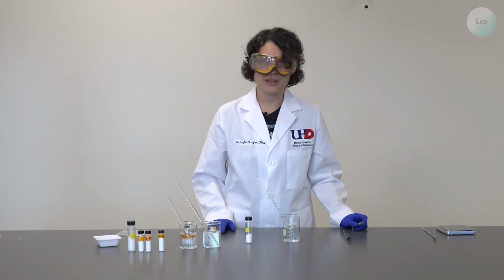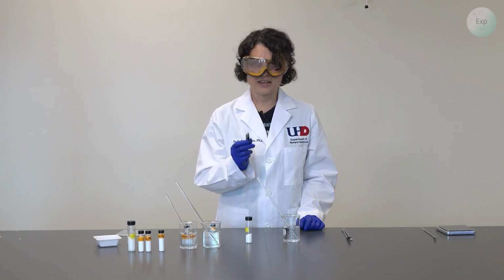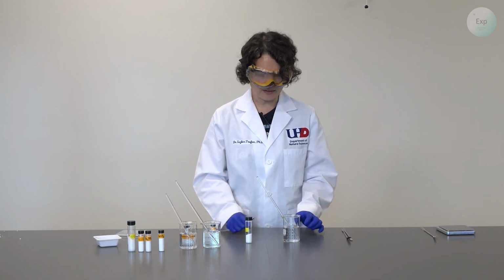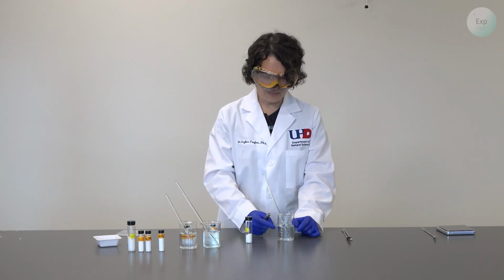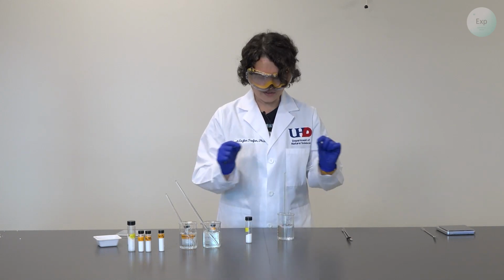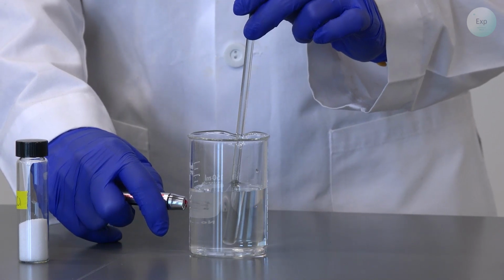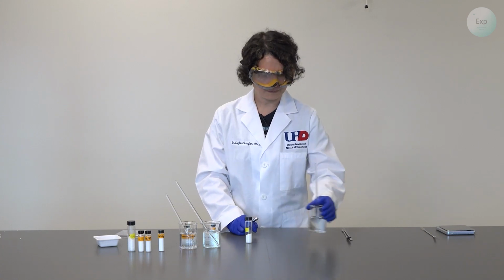Another way we can determine whether we do have a solution or not is to take a laser pointer, and this is through the testing using the Tyndall effect. If we have a homogeneous mixture, the Tyndall effect will not be observed. So when I pass a laser pointer through it, we may see a red dot at the entry and exit points, but no laser beam across the solution. And so that's what we see. 2 dots, one on the right and one on the left side of the beaker. So we have indeed made a sodium chloride solution.